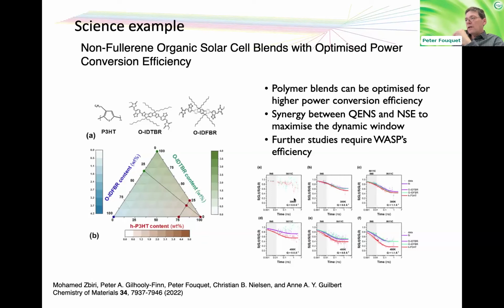With techniques like neutron spin echo, you can look at the dynamics as a function of time.